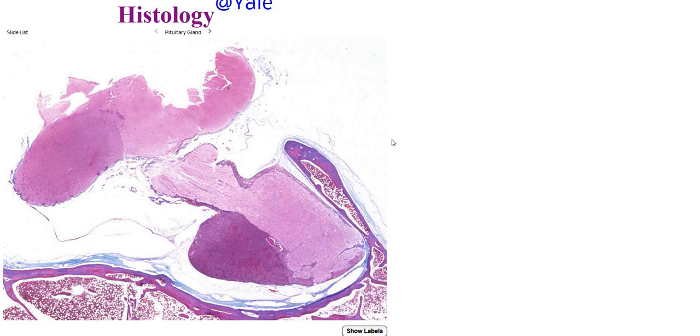Now I am going to show the labels in just a second, but before that, I want to draw your attention to our pituitary gland, and that is this tissue connected by that stalk, the infundibulum, to our hypothalamus. If we notice the color here, our hypothalamus has the same color as half of our pituitary gland.